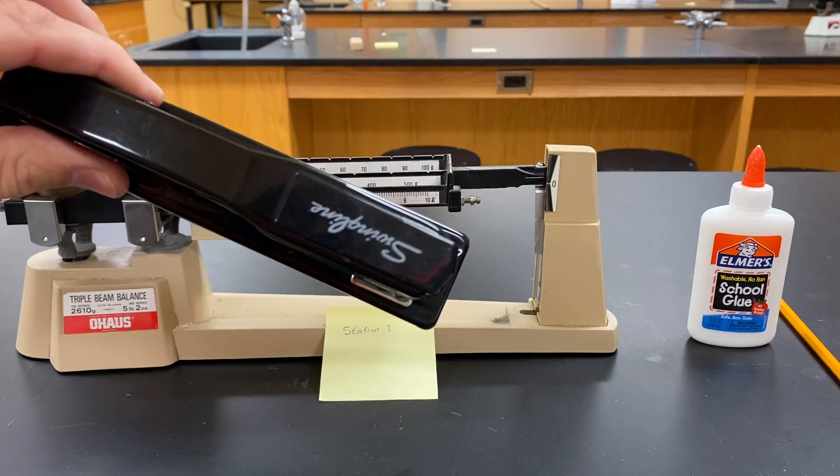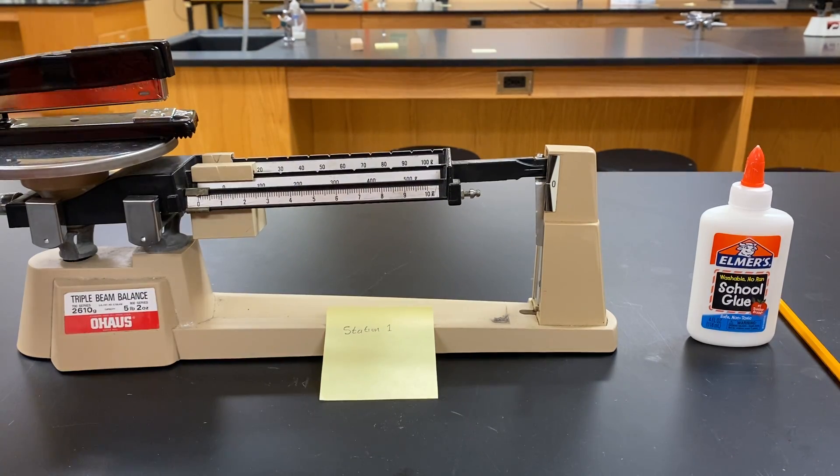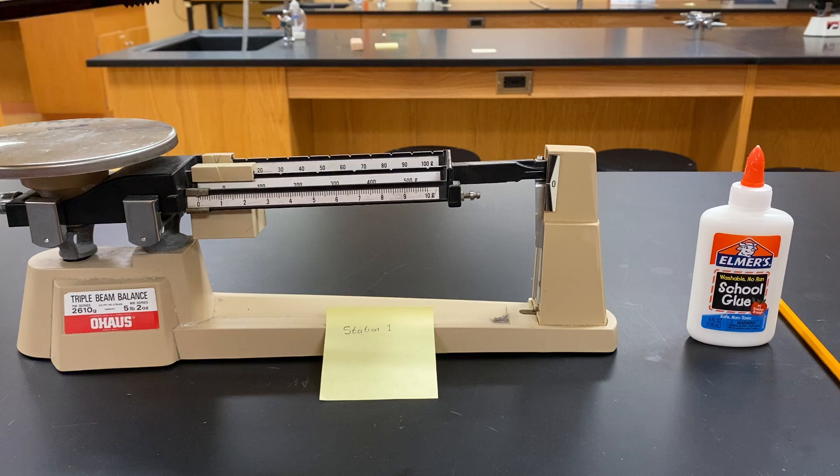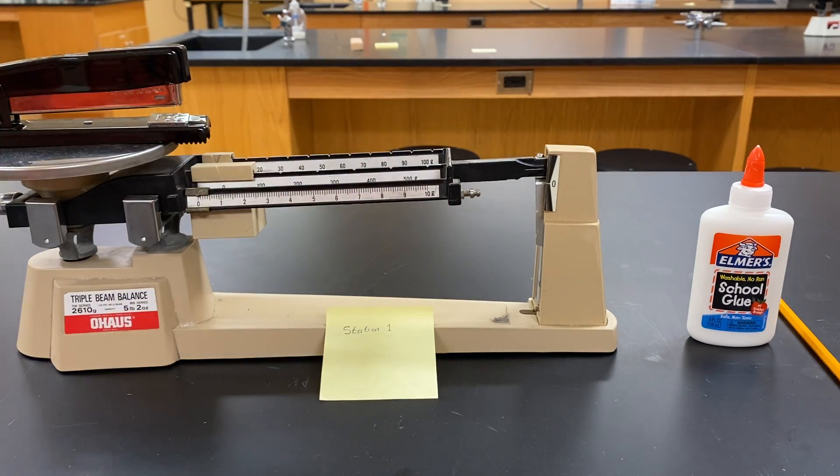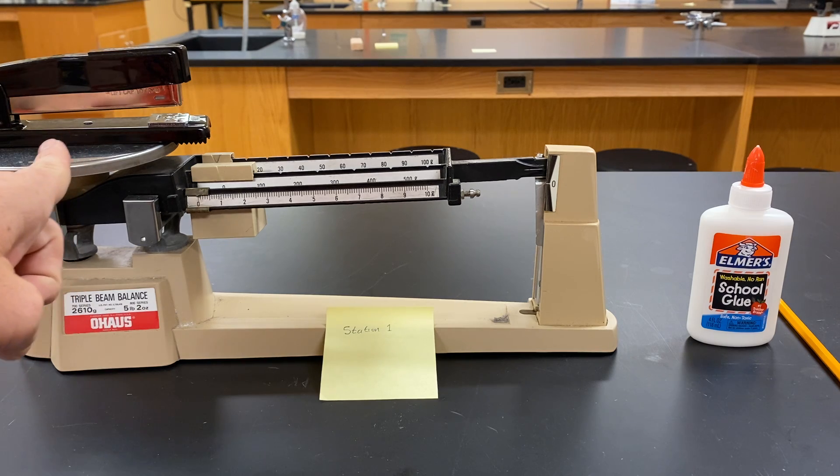Here we have our Swingline stapler. We'll set it right here on the circular pad so that we can take the weight of it. As you'll notice now, the pad makes the triple beam bar go up, which means there's too much weight over here.